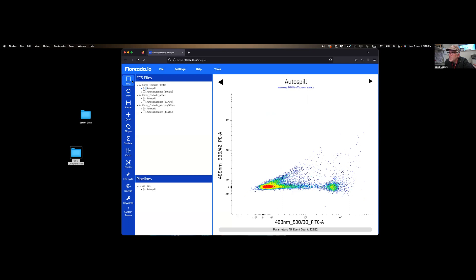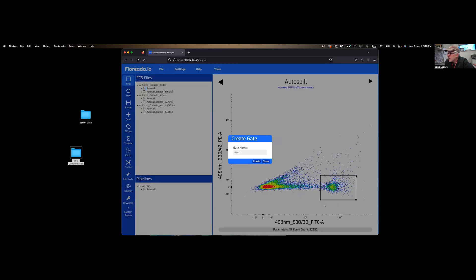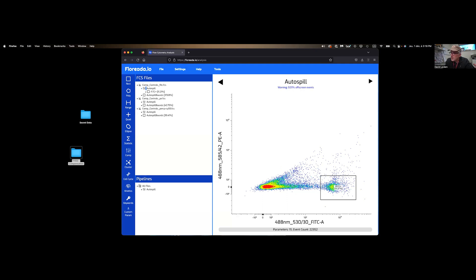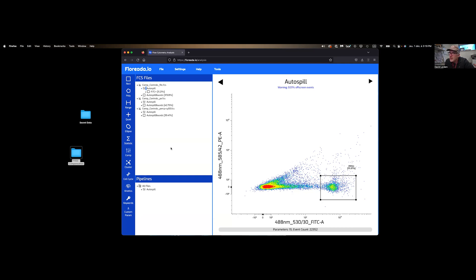From there, you can set your gates. And essentially, continue your analysis based on whatever is biologically relevant. So this is it for our compensation.